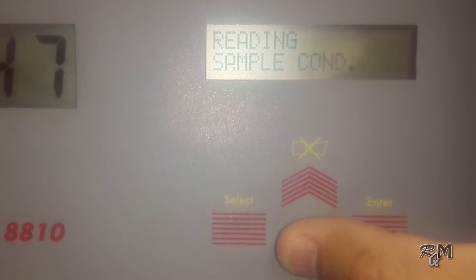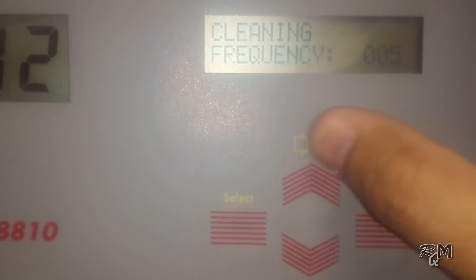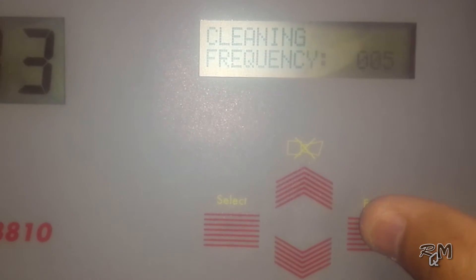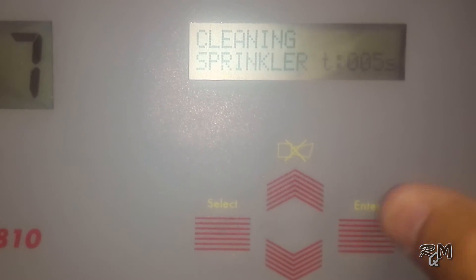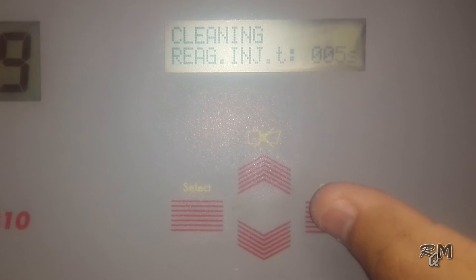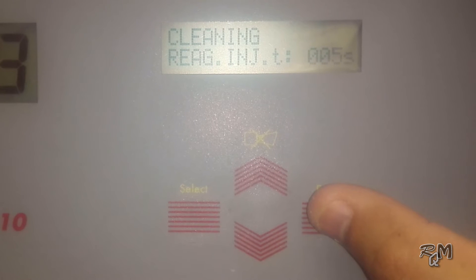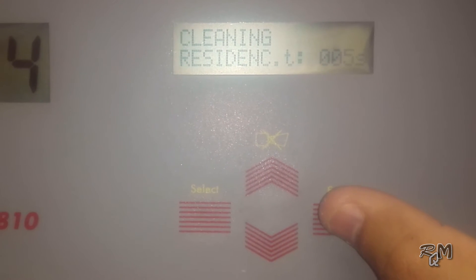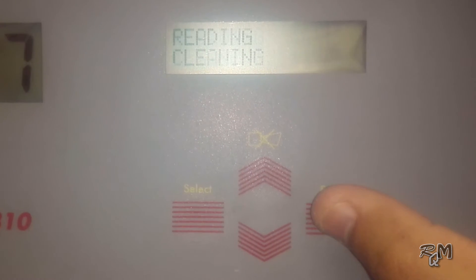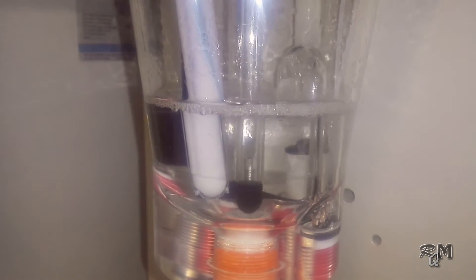Enter the cleaning menu. Frequency means after how many samples cleaning needs to execute — it depends on electrode scaling; I set it to 5. Sprinkler time means how long you want to rinse the electrodes — set to 5 seconds. Reagent injection time means how long the cleaning pump needs to run — set to 5 seconds. Residence time of cleaning solution: set to 5 seconds. As mentioned, all these parameters can be changed according to the scaling condition of the electrodes.